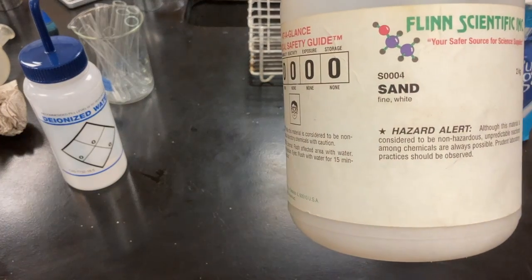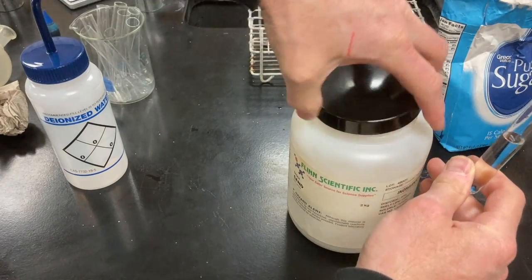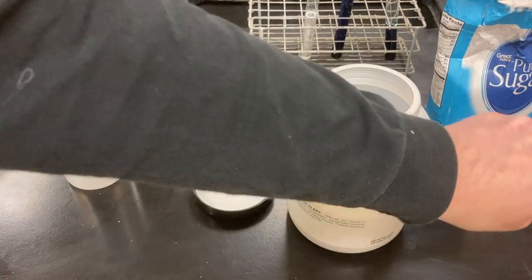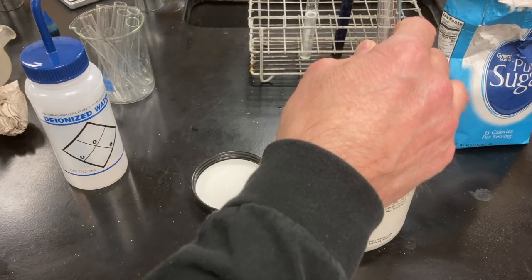So this is just a fine white sand, like you'd find on a beach, only it's really sifted. There's no impurities in it. It's just really nice clean sand. Just grab a spoon, and I'm just going to scoop out some sand and put it in my test tube to make a mixture.